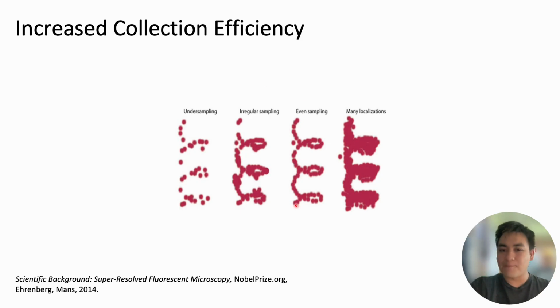It's not junk, but instead you can get a larger amount of data, which will give you more details where you can zoom in and see, oh, this protein is moving through the membrane, or the interior of this mitochondria is changing in respect to this factor, right? Being able to get that data much faster will also allow you to image live cells, and is really important to see these active processes happening in real time.